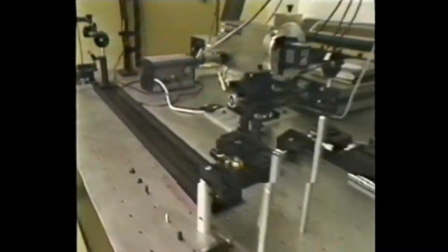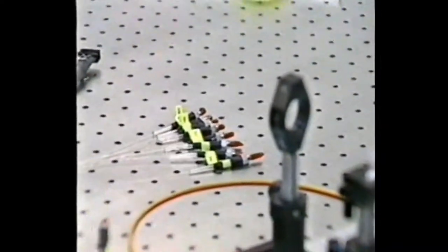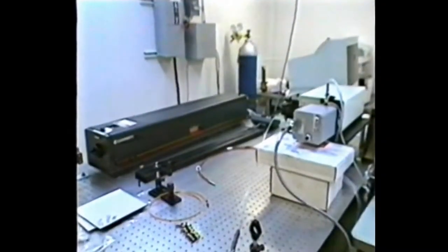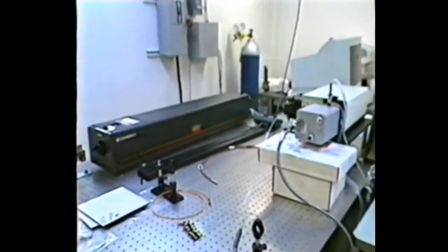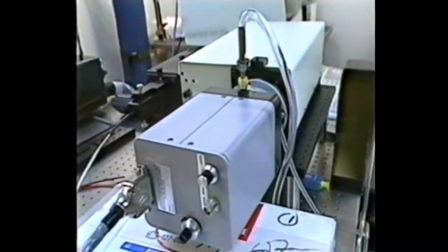Studier showed us another system designed for 8 capillaries. Eventually, they hope to expand the capacity to 96 capillaries, each being read 6 times a second. If the machine works in the way we expect it to work, then any place could have it because there's very little labor involved. There's just one or two people needed to feed the machine. And so it could be anywhere producing large amounts of sequence. So in fact, what we would hope would be there would be a dozen of these machines or so would be enough to do the whole human genome.